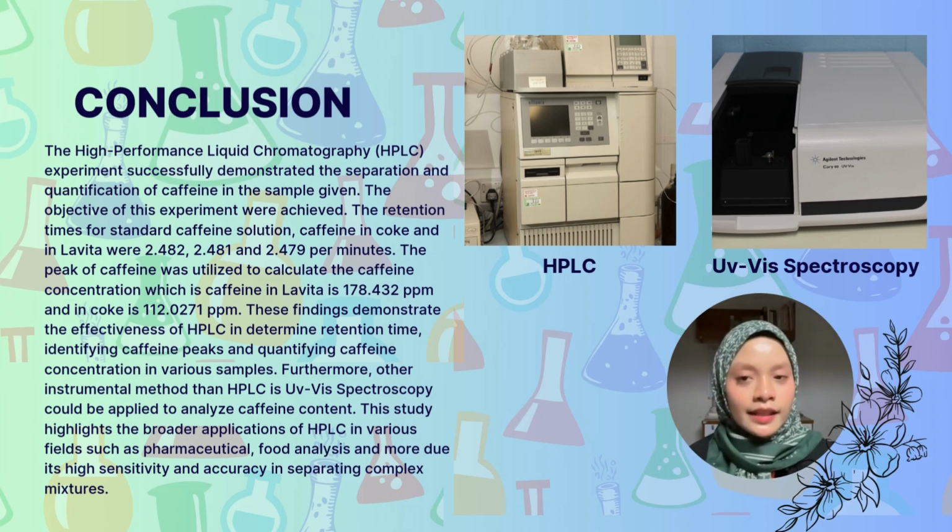In addition, this study highlights the broader application of HPLC in various fields such as pharmaceutical, food analysis, and environmental monitoring due to its high sensitivity and accuracy in separating complex mixtures.